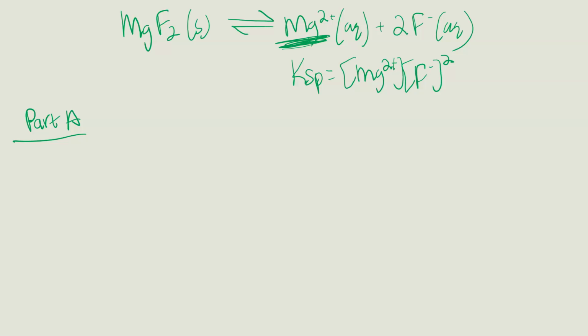Now, I know for part A, if we look at the equation that's up there, there's no chloride. Well, in part A, we're not actually doing that reaction. In part A, we're just making magnesium stuff. We just care about this part. So you're going to be doing a dilution using 250 milliliter volumetric flasks and pipettes. So you will be calculating the molarity of the magnesium using the dilution equation, where one side is the stock solution and the other side is the dilute solution that you're making.